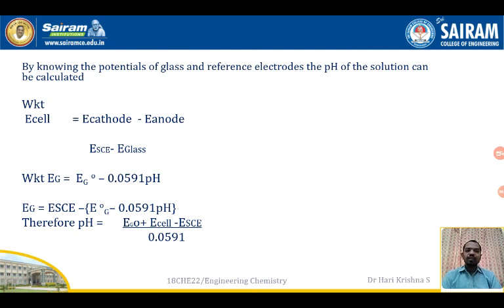In the laboratory, we take a calomel electrode, couple it with the ion selective glass electrode, dip them in the acid solution, titrate it against NaOH, determine the pH of the reaction, and determine the pK value of the acid. By knowing the pH of the reaction, we can determine pKa. pKa is inversely proportional to strength. What is pKa and how do we determine it? We are going to do it in detail in our laboratory when we come to the lab. Thank you.